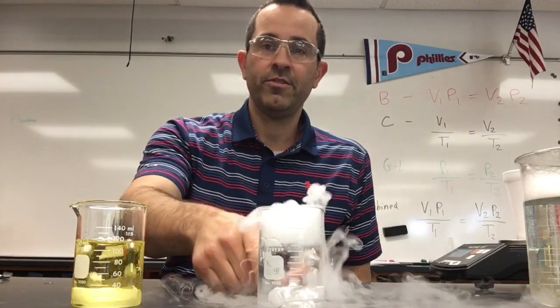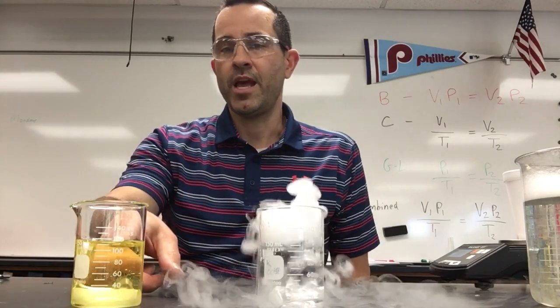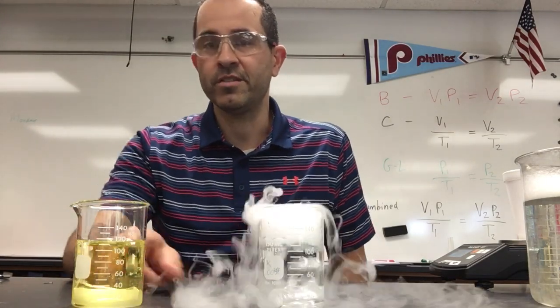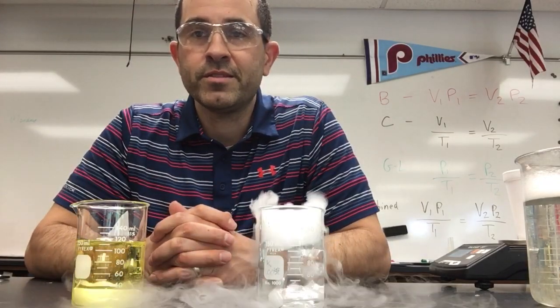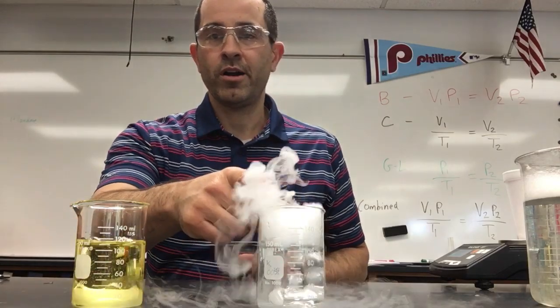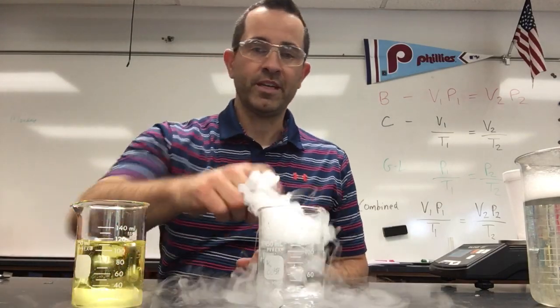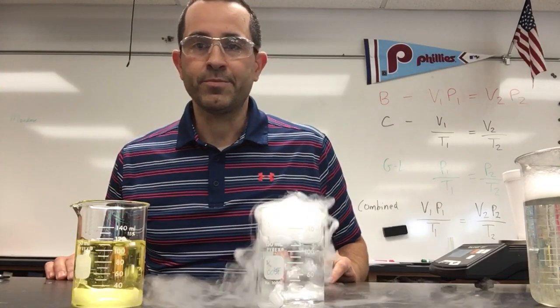Well, if it's in this beaker that contains water, and we don't see that fog here in this beaker that contains the vegetable oil, then what do you think it is? Take your best guess. And the answer is water, right? It's cooling down the water, and so that fog is water vapor condensing. All right, so that's pretty cool.